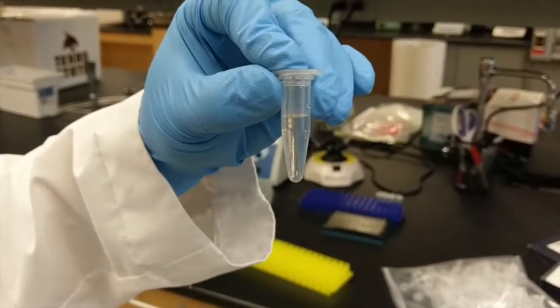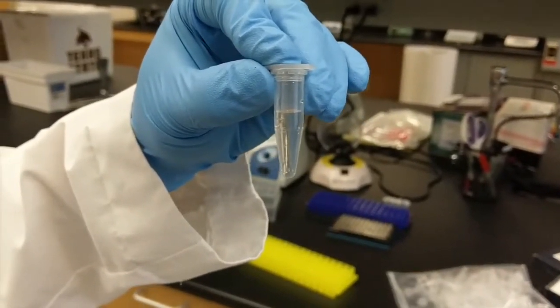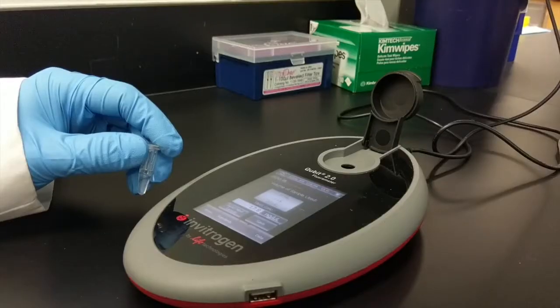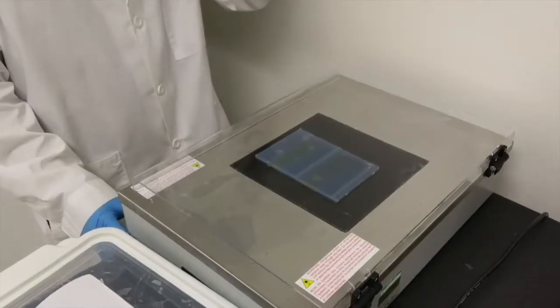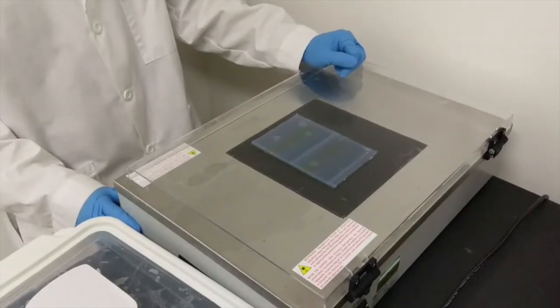Now that we have pure extracted DNA, we have to test to see if it's clean, high quality, and good amounts in order for us to do downstream analyses. In order to see the concentration of DNA within our extractions, we use a machine called the Qubit. This will tell us the amount of DNA that we have in our extraction based on a fluorescence method. We also tested the quality of the DNA using gel electrophoresis.